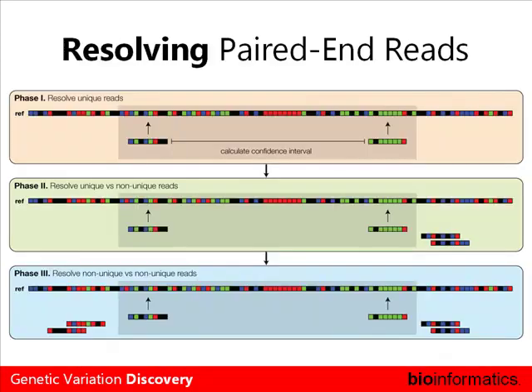Yes? When you scale up the number of reads, is there any lag in rendering? No. Actually, when it comes to speed, the only limiting factor is the length of your genome. So yeah, if you were to try and align the lily genome, I think Mosaic would just die. No, we can handle mammalian type genomes pretty easily. And so that's why when we had 6 billion reads to align, it wasn't that long.